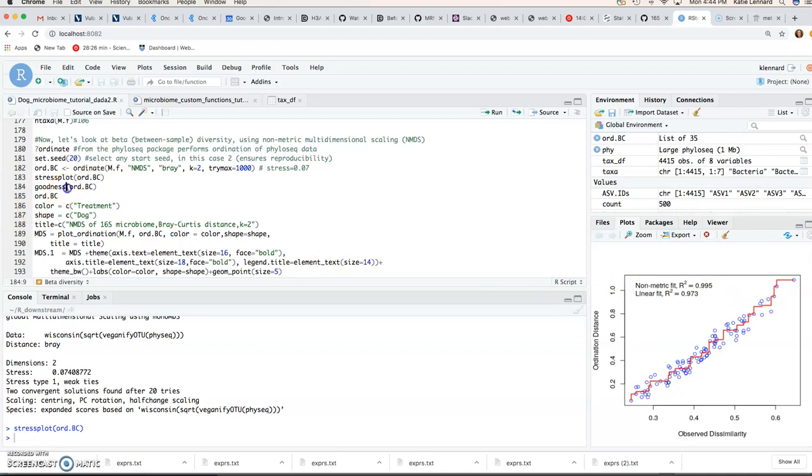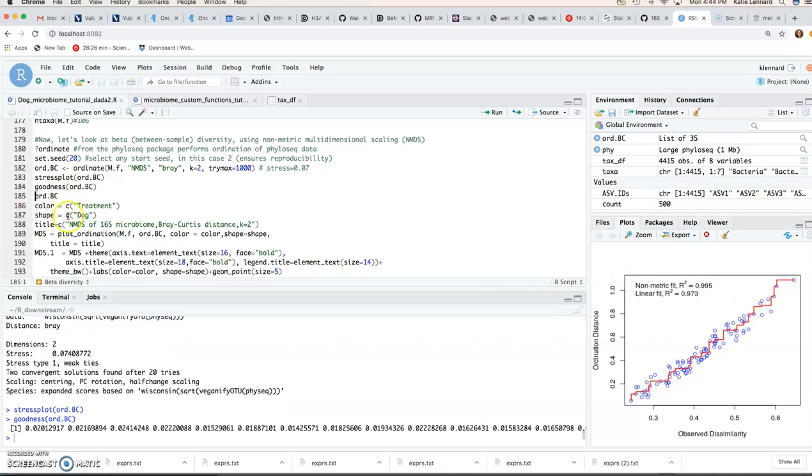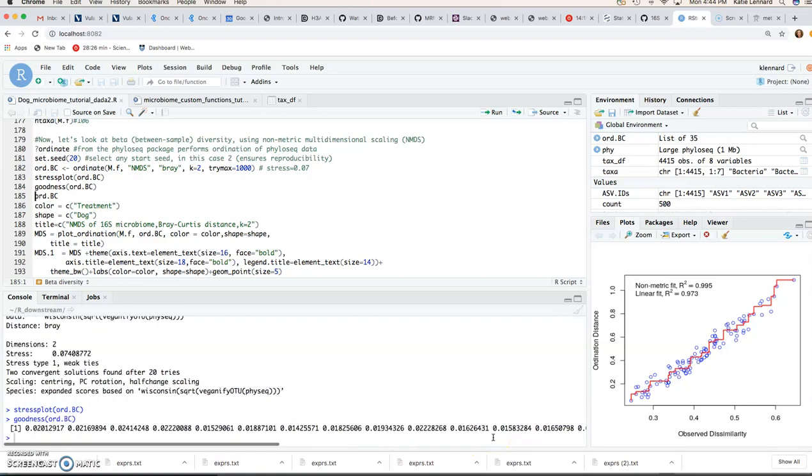And then you can also use the goodness function. And that gives you kind of a value for each of your samples of how well they are represented. And the lower this value for each sample, the better.